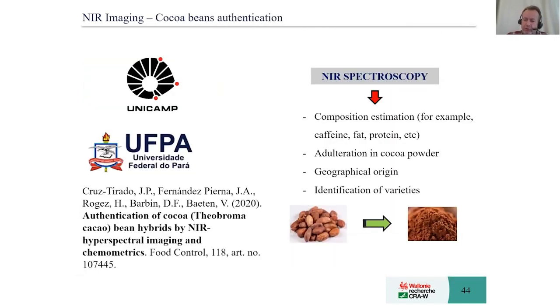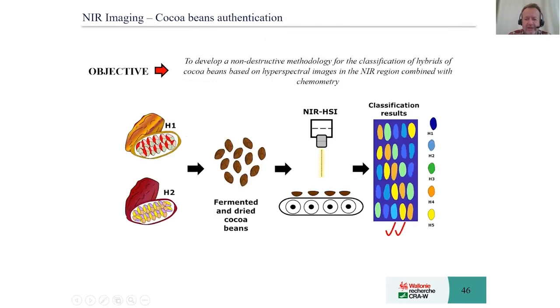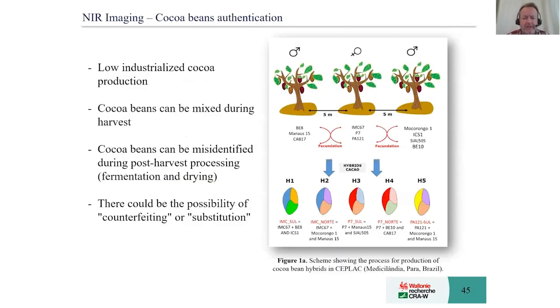In order to finish my talk, a few slides now about the cacao. I think it's a good thing to finish there. You will remember a little bit from this presentation, I hope, that we speak about chocolate. We are Belgium. And we had a nice project with Brazil, where in fact, in Brazil, you know, the Amazonian basin, it's the origin of the cacao. And they have there a lot of different phenotypes. And so they want to have tools that allow them to check rapidly the different phenotypes present there. And so we had the chance there to look at these individual kernels.